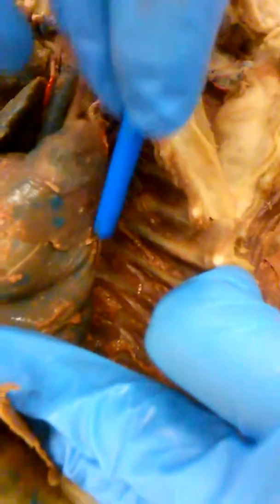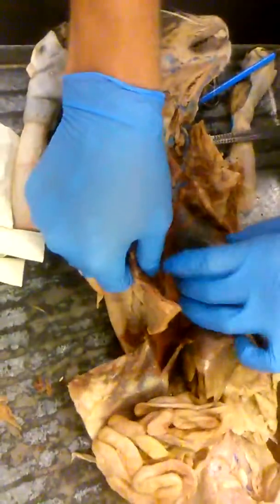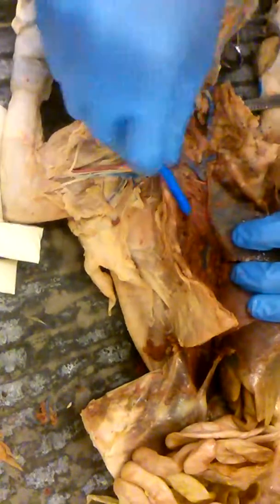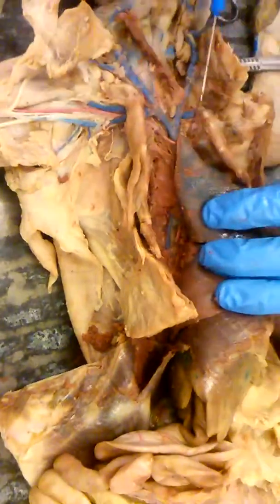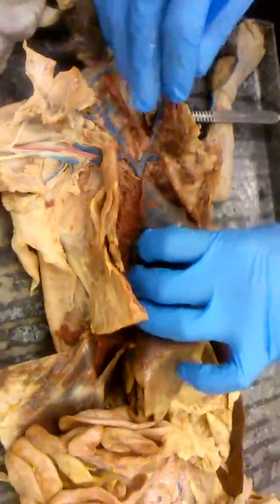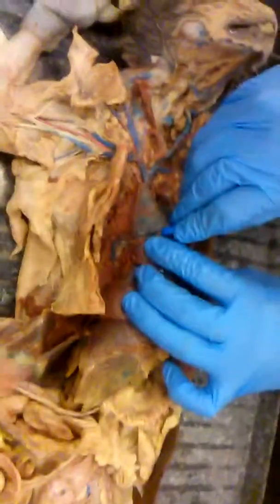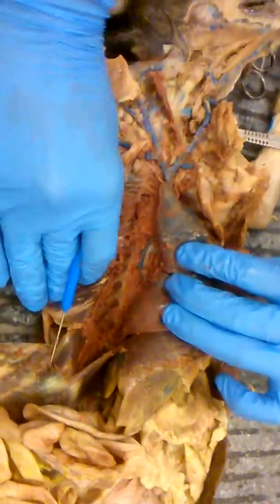Yeah. They dump into one long vein that runs along here, and the blue dumps back into the back side of the heart. You can't see it very well from where I was. I'm trying. There it is. So right there is your azygos vein. That blue one? Yep. So it's kind of a collecting duct for all these right here. Can you see it? So it's that blue one back in there. Pull these ribs down. There you go. And then it dumps back into the back side of the heart.